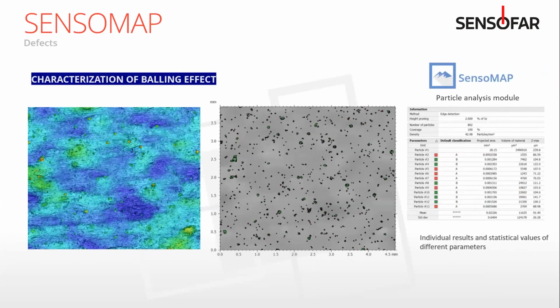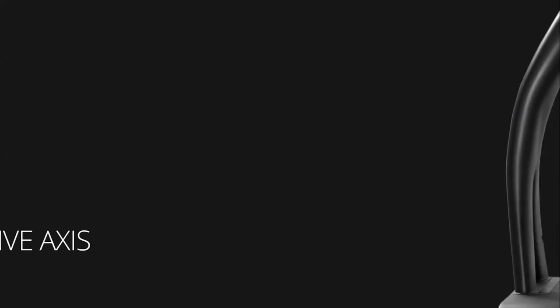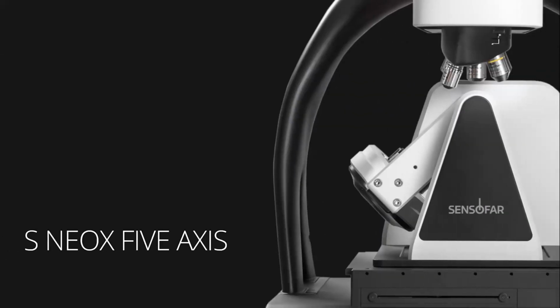Particle analysis is also another area where Sensomap really excels. We have a lot of customers now that are interested in looking for defects on their parts, and you can get statistical values and any analysis you'd like of that particle. So looking for a particle that's larger than a certain size or below a mean plane is totally doable in Sensomap, and it's kind of our best option for doing that right now. So that sort of concludes all of the software analysis stuff, and we can talk more about that later.